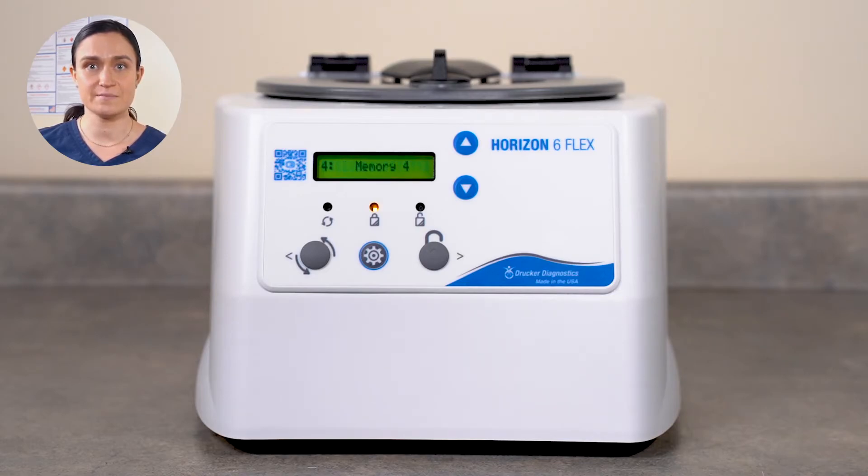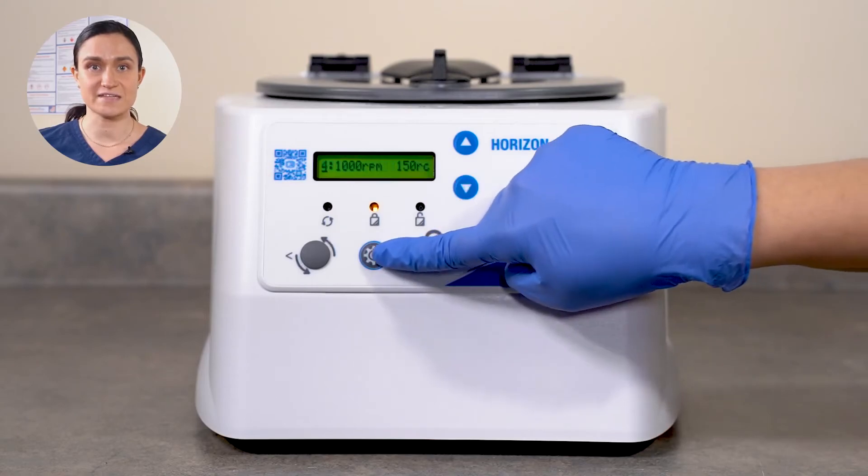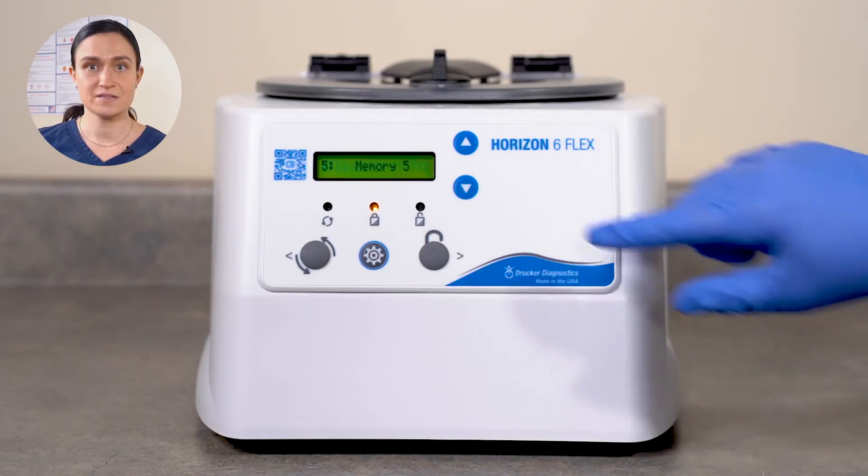Existing saved cycles can be edited, new saved settings can be logged into the Horizon 6 Flex's memory, and Cycle Lock or Preset Lock can be engaged. To learn how to program your Horizon 6 Flex, follow the links that are appearing on your screen now. If you still can't edit your cycle parameters, contact Drucker Customer Service and we'll be happy to help.